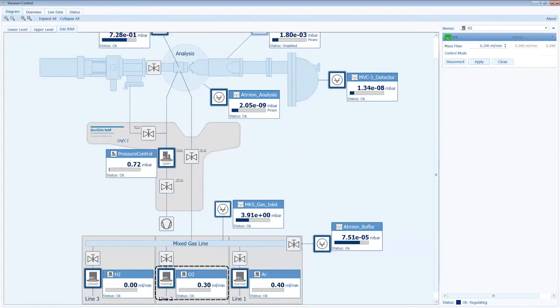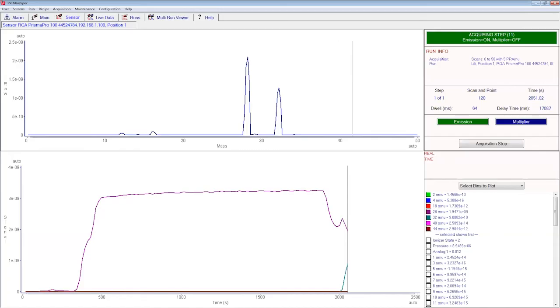We need to add more. It might be around, right? It's beginning to maybe more. Depends. Argon has mass like 40, O2 has 32, so I think it depends on the atomic mass, like which constant. But roughly, I guess 40. 32 and 40 is not so big a difference. Maybe a little bit. Let's see how this pyramid looks.